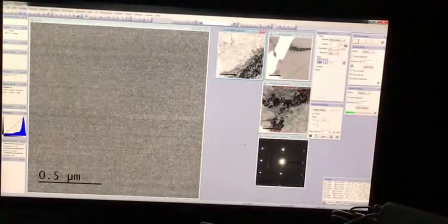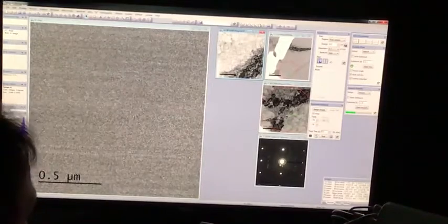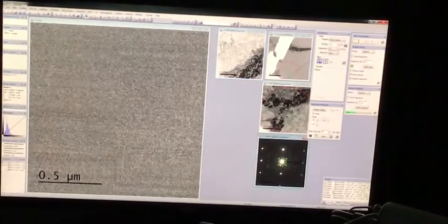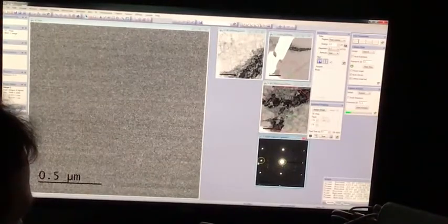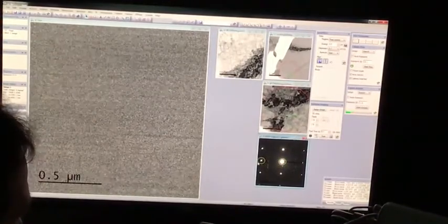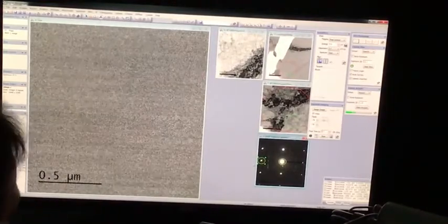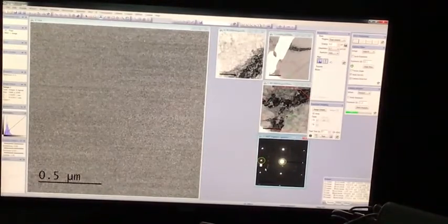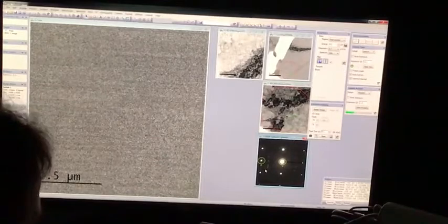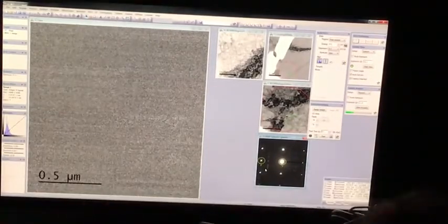And so what I've done before the big reveal is I have put the aperture right here. I've moved the objective aperture to be around that beam there. So that's going to be position 2. And this is the image of exactly the same area. I'll save that. That we're going to get. So here's the big reveal.